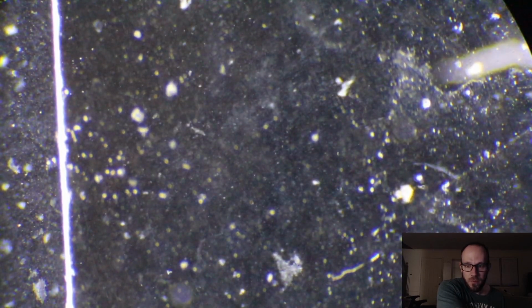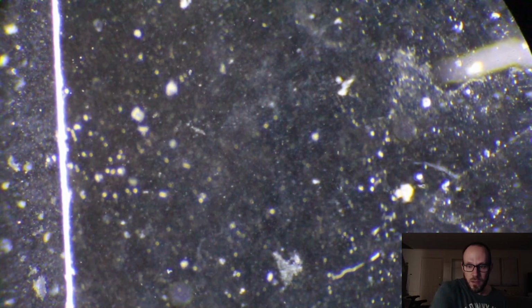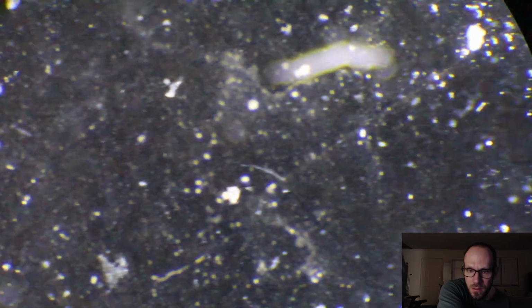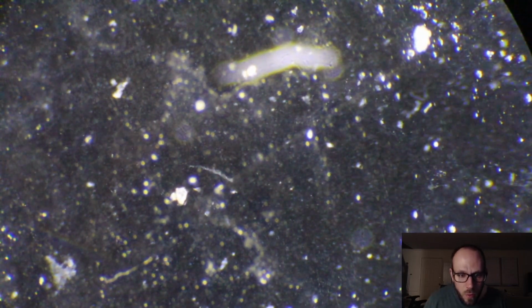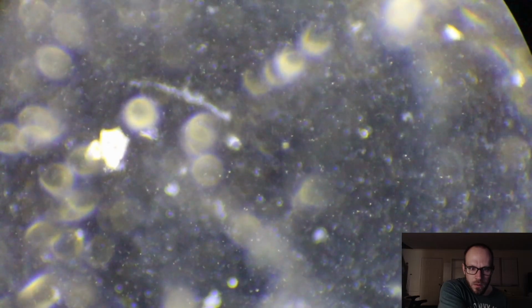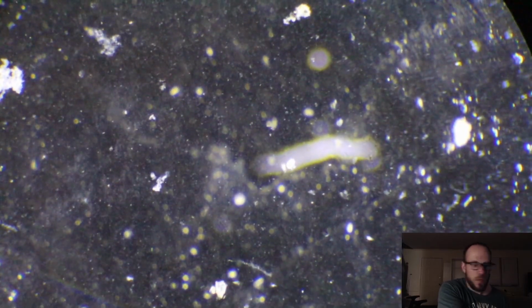But yeah, I do have slides replete with life that I have preserved, so... There's something on the right side that's moving. What is that? Oh, you are so small. You're pretty much centered, though. I don't see any movement. There you are. Wow. Yeah, very small. Anyway, back to combing the slide.